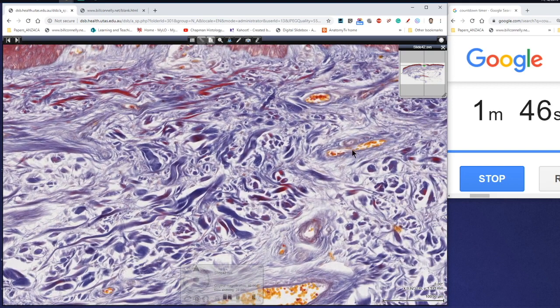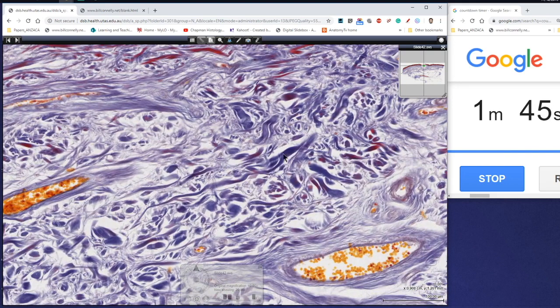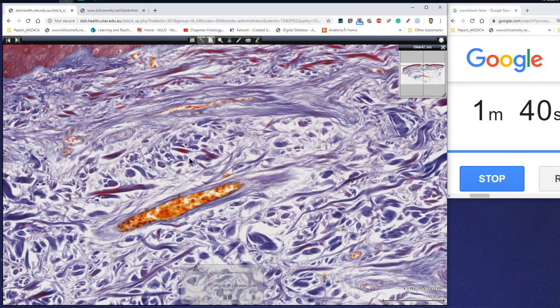You can see the larger blood vessels out here as well, but predominantly what we can see is these thick bundles of collagen and elastin running in many different directions.